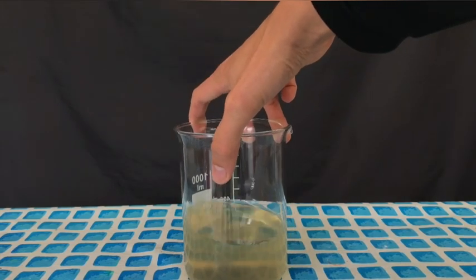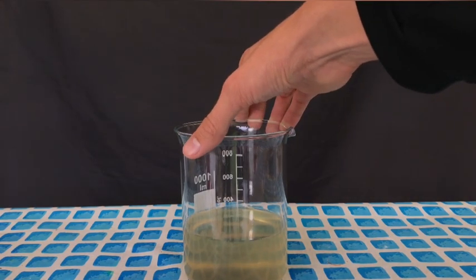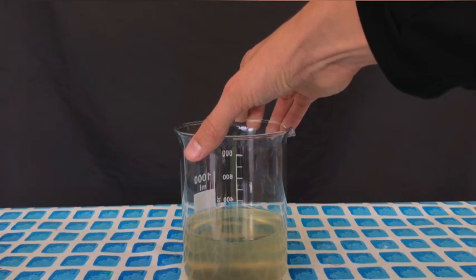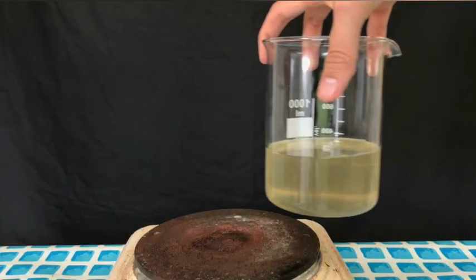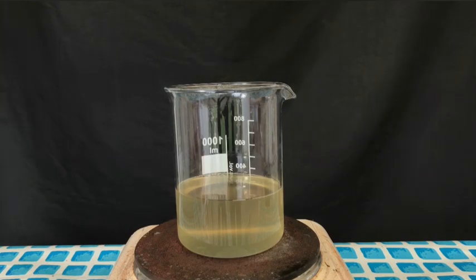Afterwards we were left with this dirty looking liquid, which has to be boiled down carefully. If it gets too hot while boiling it down, it will decompose into acetone. The calcium acetate, distilled water, and acetic acid solution was then boiled down carefully using a hot plate.